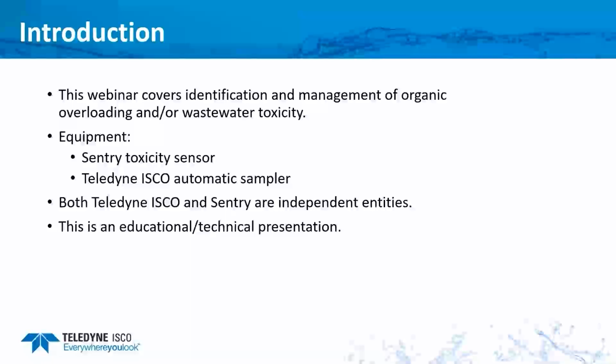So we will start our presentation with the SENTRY toxicity sensor and how it works and how it captures the toxicity event in real time. We will then present how the Teledyne ISCO automatic sampler can help take a representative sample of the event detected by the SENTRY sensor. It will be a very interesting webinar, I will say that.